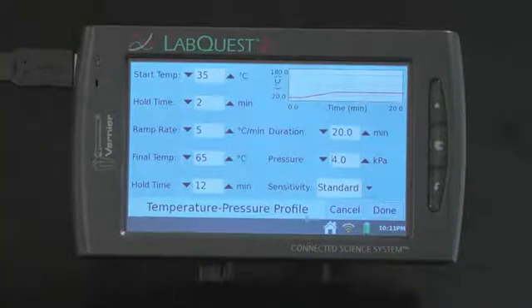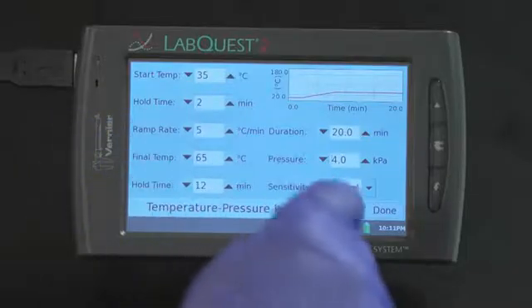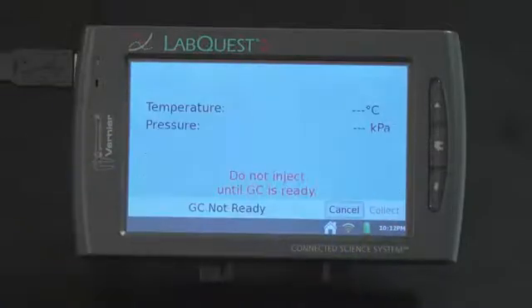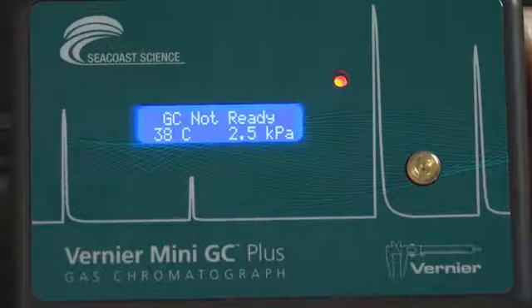Data collection will end after 20 minutes. Make sure the duration of the run is long enough to ensure all the compounds have passed through the column. Select Done to initiate Mini-GC Warm-Up. A new message will appear. Do not inject until GC is ready and the LED on the Mini-GC Plus will be red. The Mini-GC will take a few minutes to warm up and stabilize.